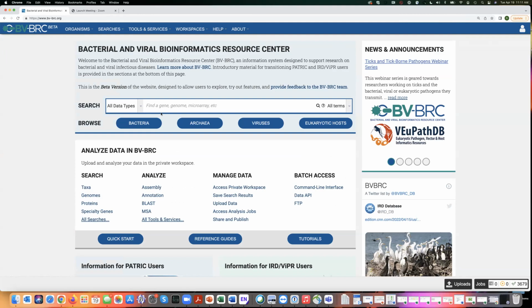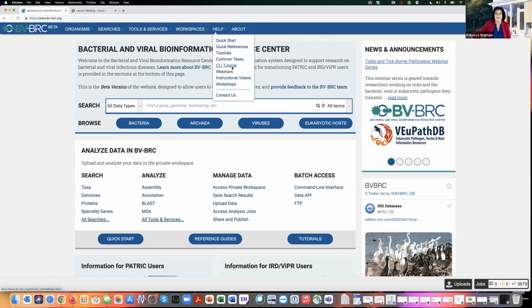Okay. So this is the home screen for the Bacterial and Viral Bioinformatics Resource Center. Now we have tons of information about this. We've given tutorials, webinars, instructional videos. I can't go through everything today, but I want you to know that this is all here under the Help tab for you.